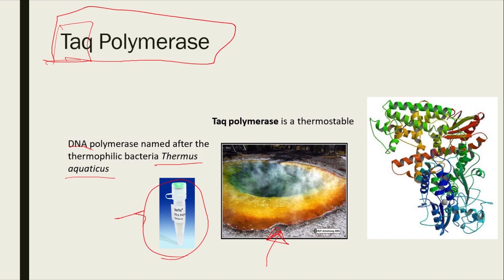Now, talking about commercializing Taq polymerase, I have a small story to tell you guys. So I told you, in my lab doing PCR reactions is a daily routine, especially in the summer. Everyone is doing PCR, and so I do a lot. I'm thinking perhaps my lab uses the most amount of Taq polymerase in the entire Northeast PA region. Yes, I do use a lot. Now, for a commercial tube this size, like in the figure, it ranges about $120 or so, depending on what brand you're getting.